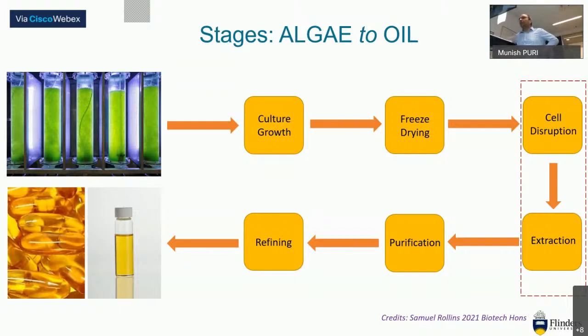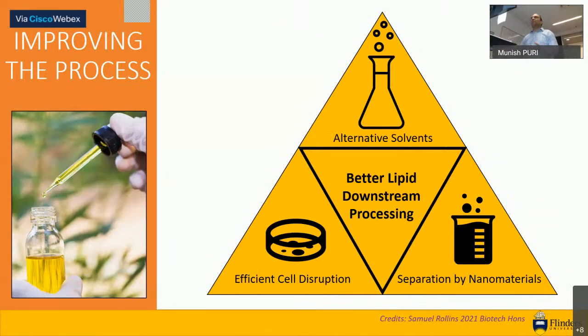Disruption of cell membranes and walls is desirable to improve lipid release. Now we are talking about the lipid being there; you need to take the lipid out of it. Lipids are separated from other compounds generally by using solvents, which is the only method of choice available. People use hexane or chloroform-methanol. We have evolved some green methods to extract lipid, but they need to be extracted and then purified.